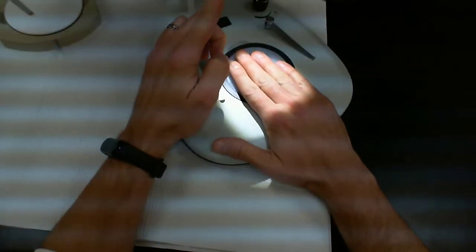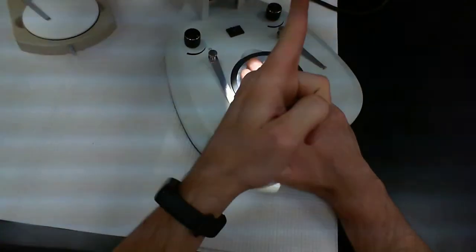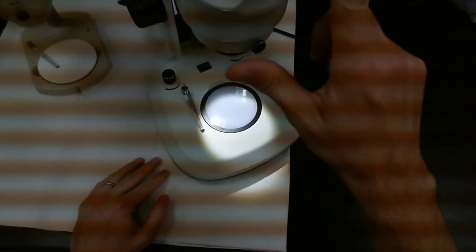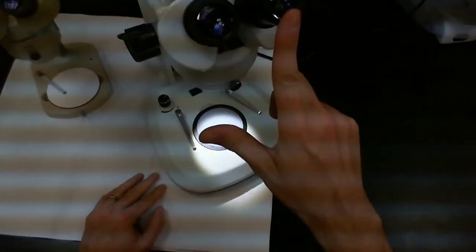What's going to happen is that light will be reflected off my hand and go up into this objective lens and be magnified. I will see a much larger version of it up here through the ocular lenses.